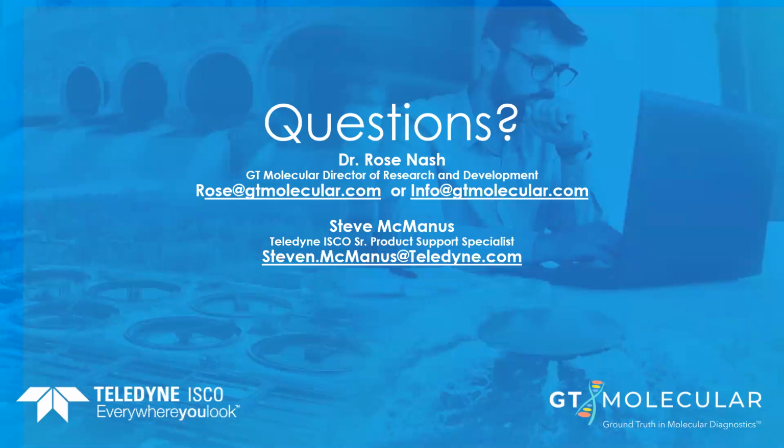The next question looks like it is going to be a two-part answer, where both Dr. Nash and I can provide the answer. The question is, what biological hazards should be considered when handling a sampler by humans in the COVID-19 pandemic? What protection is needed?